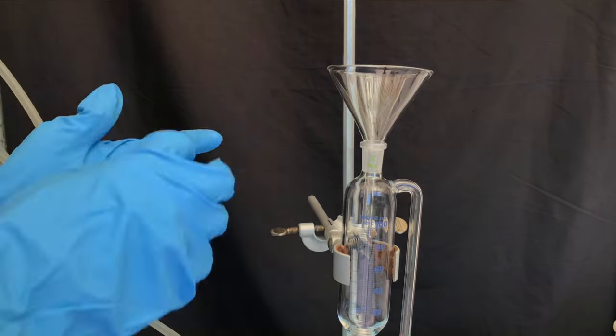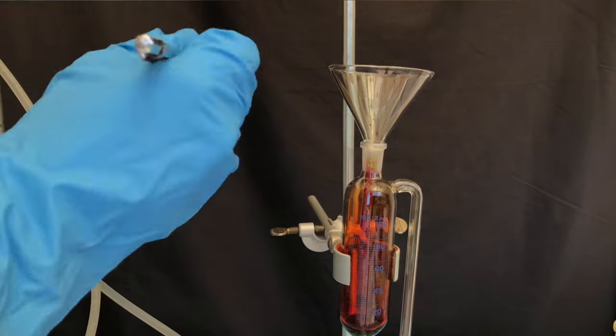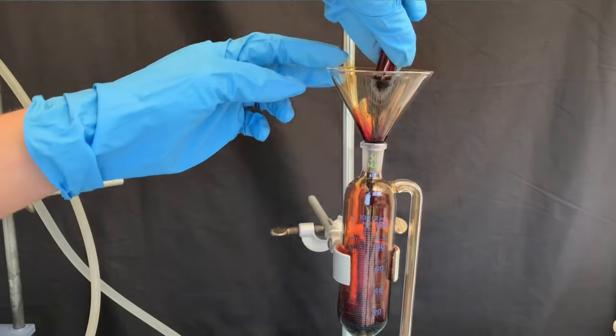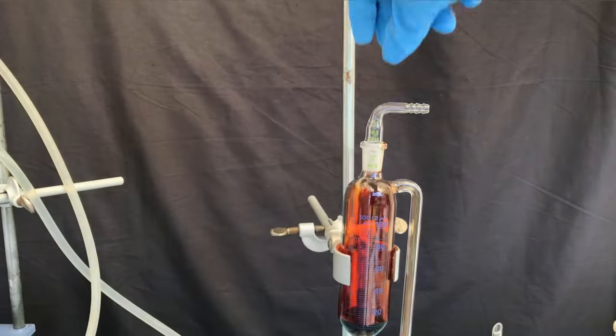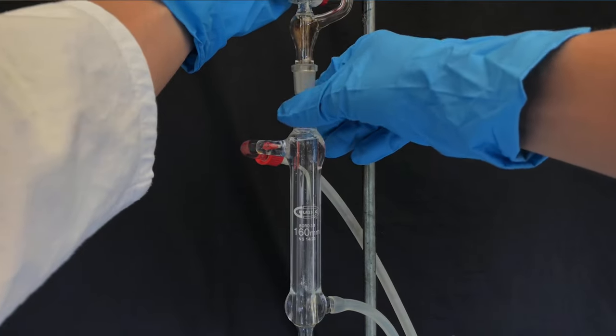The 11 milliliters of bromine were added to a pressure equalizing addition funnel. Just look at these beautiful red and deadly vapors. The gas mask wasn't our only safety precaution. We also had a fan running on high speed in the background. Grease was applied to the joints and everything was connected.